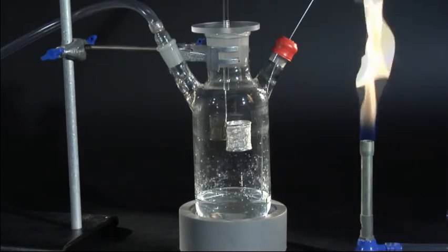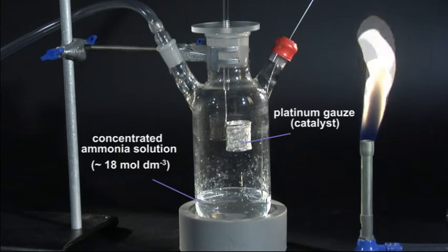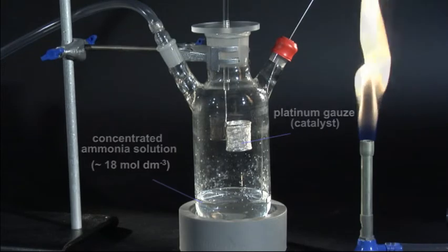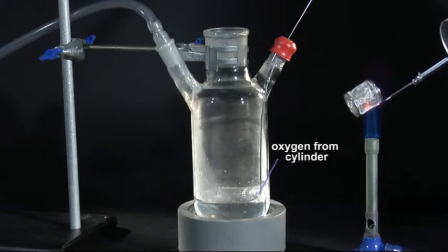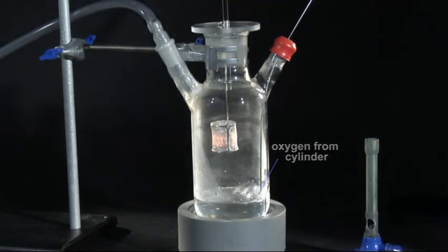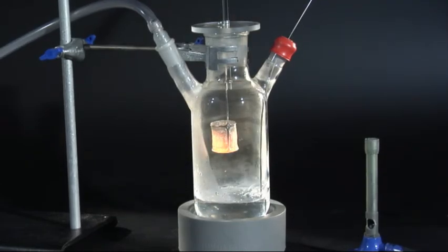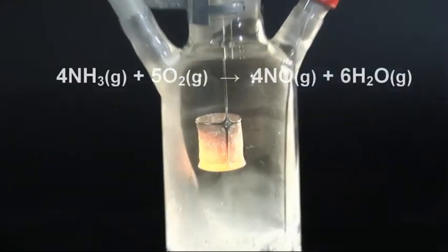In this demonstration, oxygen is gently bubbled through concentrated ammonia solution to provide a mixed atmosphere of the two gases. The warmed platinum gauze soon glows yellow-hot as the exothermic reaction raises the temperature of the surface.